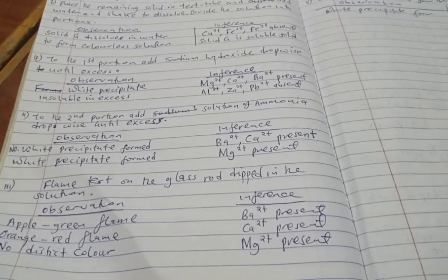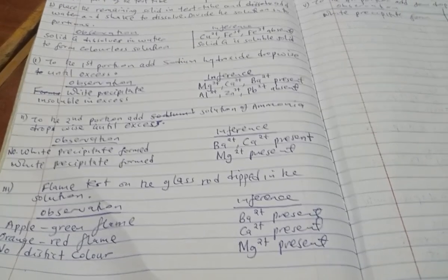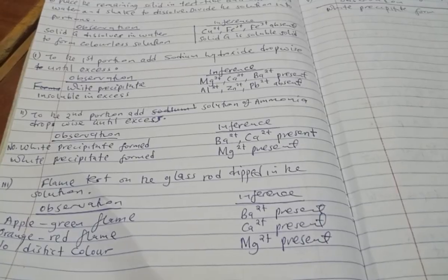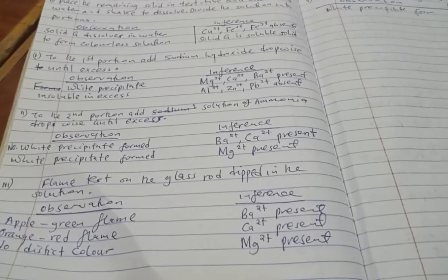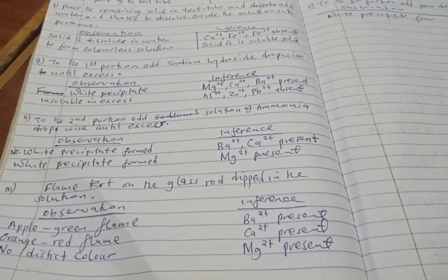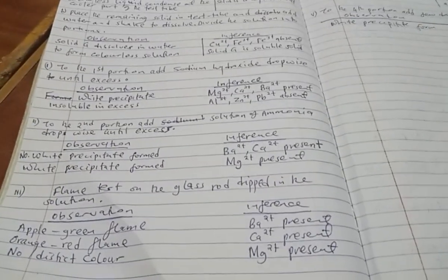If you see an orange red flame, sometimes also known as brick red flame, that is calcium. If there is no distinct color, then it is magnesium. In practical, you must always do and write what you are seeing with your own eyes.